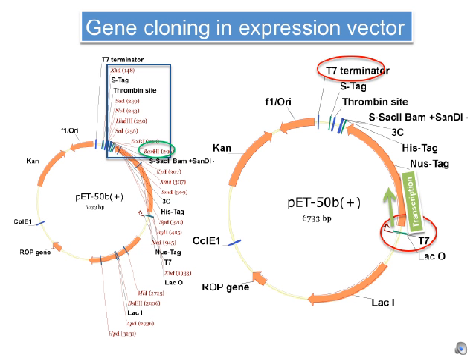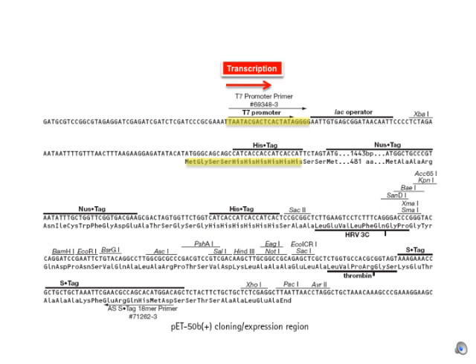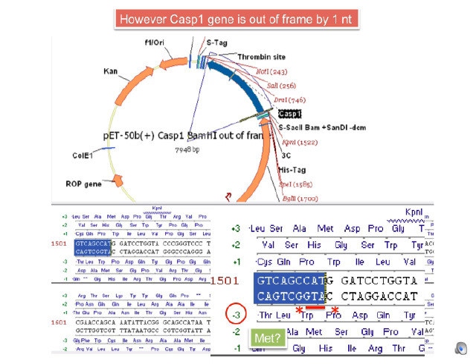Various academic and industrial research labs are interested in protein expression. You will simulate expression of proteins using PET vector series. In this exercise, you will learn to read the sequence of expression vector literally nucleotide by nucleotide and clone the gene of interest in the right reading frame.